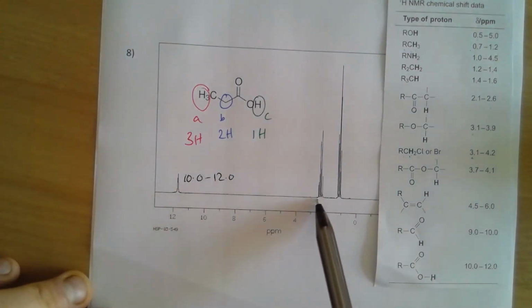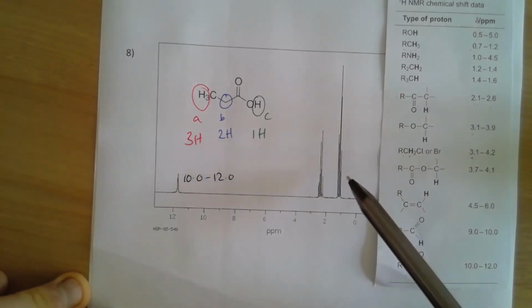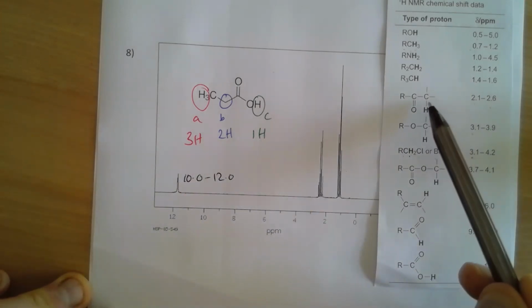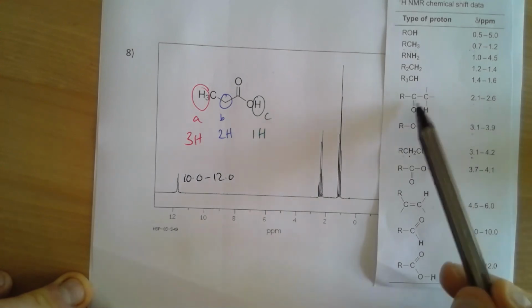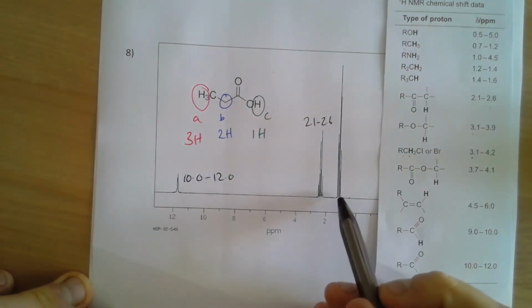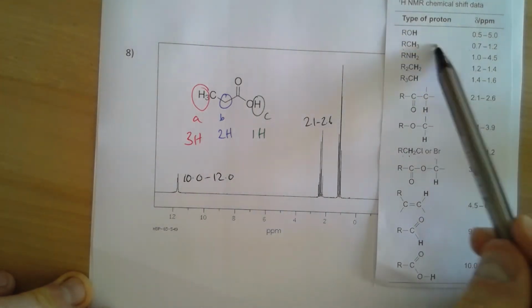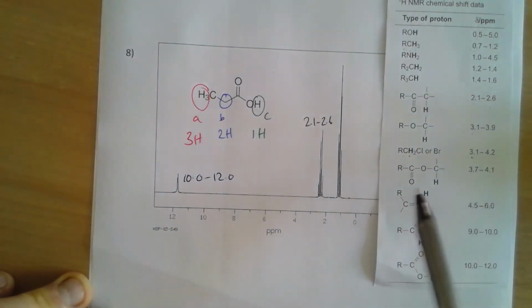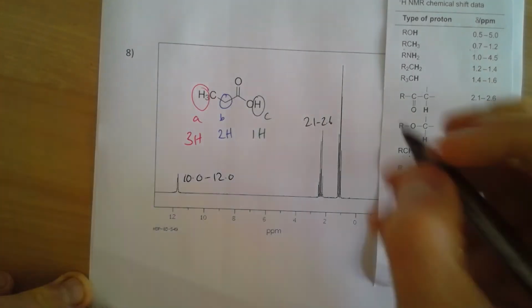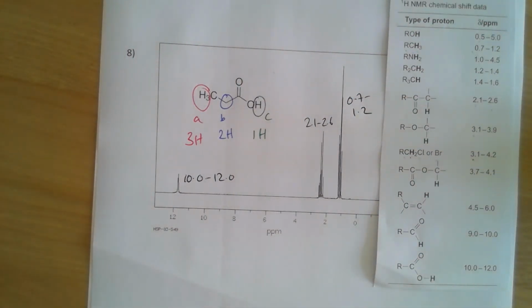For these two here, we could use the splitting pattern to identify them, but we can also do it based on chemical shift. Environment B is likely to be this one, due to the fact it's shifted between 2.1 and 2.6 here, so that group there. And that means that environment A is going to be this one here. We would reasonably expect it to be one of these ones here, but it will have been shifted downfield to some extent by the electron withdrawing nature of the carboxylic acid group there. So we expect to see it between 0.7 and 1.2, and we just about see it at 1.2. Okay, thank you very much.